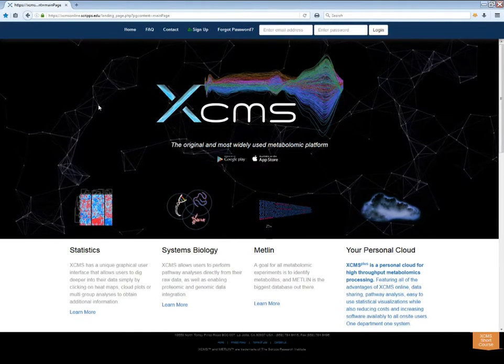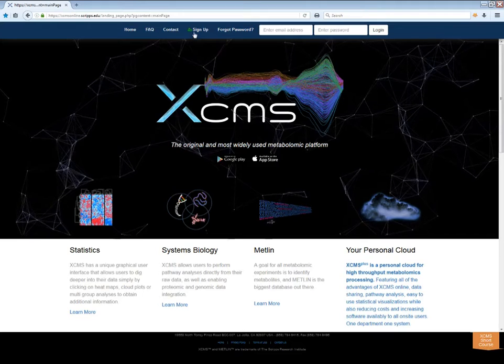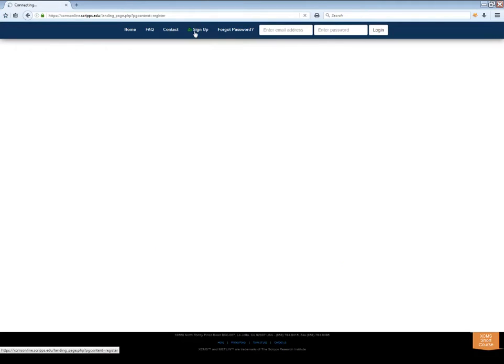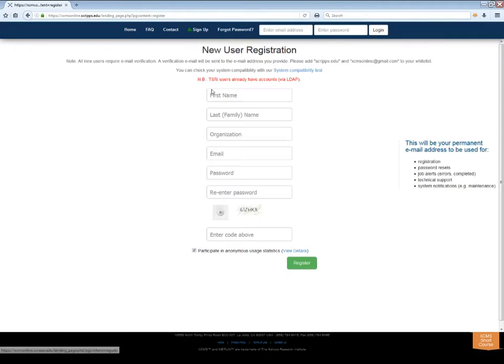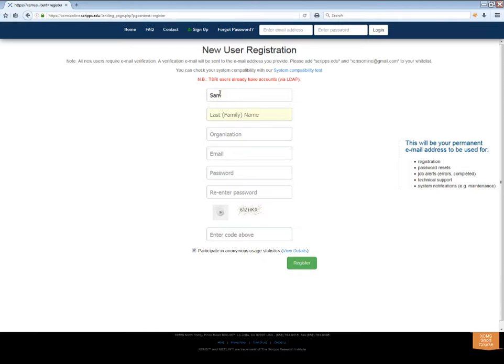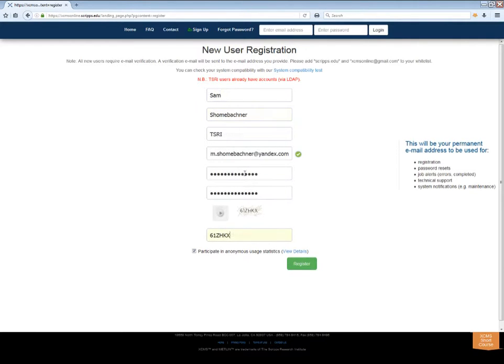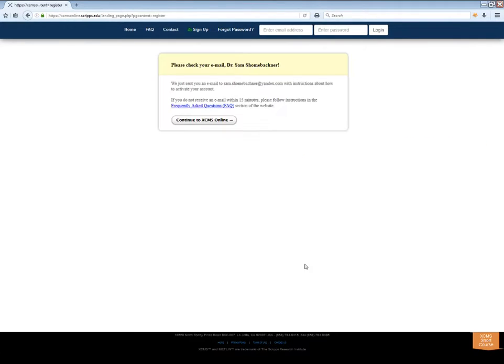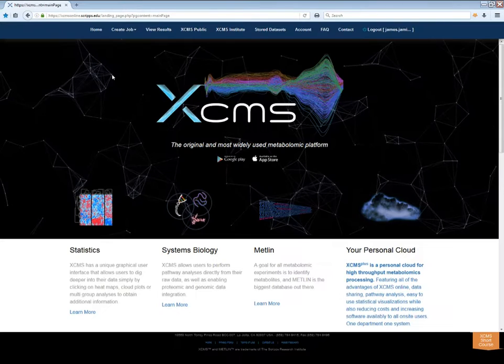The first step is to register an account. Click Sign Up in the top navigation bar to load the new user registration page. Enter your information in all the fields and click the Register button. You will receive an email with instructions on how to validate your account. Once you complete this step, log into the system.